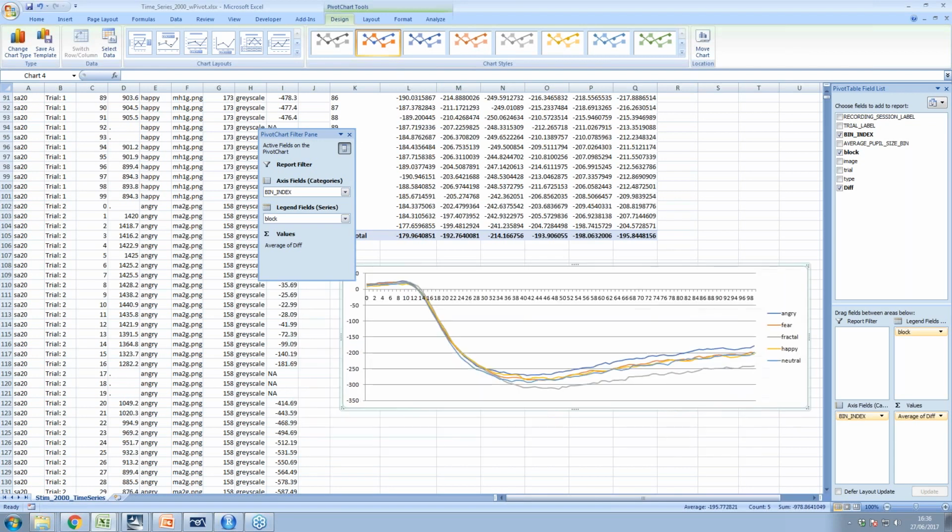within a trial, again averaged over hundreds of trials, but for each participant. You can see everything starts off, this is immediately after the images appeared, not much happens, then there's this massive reduction, and then this very quickly stabilizes to a situation where there is a clear difference between angry faces. So angry faces are different from all of the other faces, all faces are different from fractals. This is illustrative data. This is not how you should analyze your data necessarily.